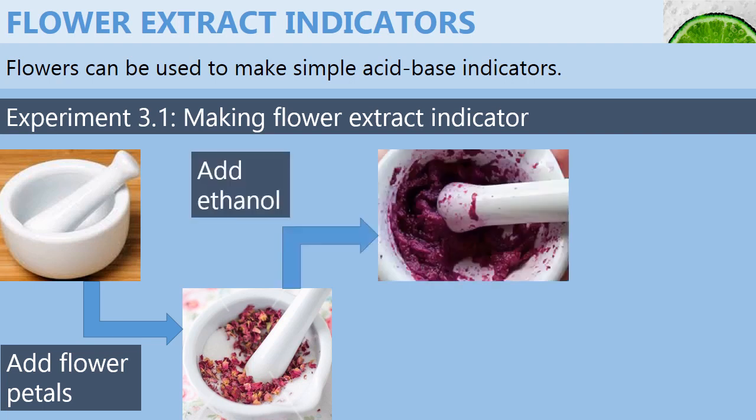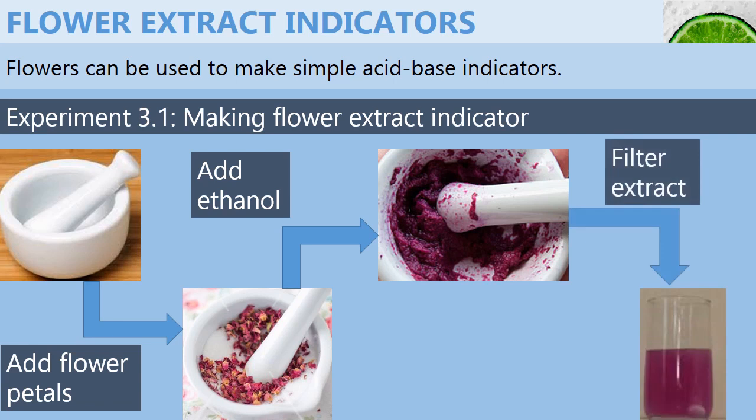add a little ethanol or propanone as you continue crushing until a deep colored solution of the extract is obtained. Next, you'll filter the extract into a beaker.